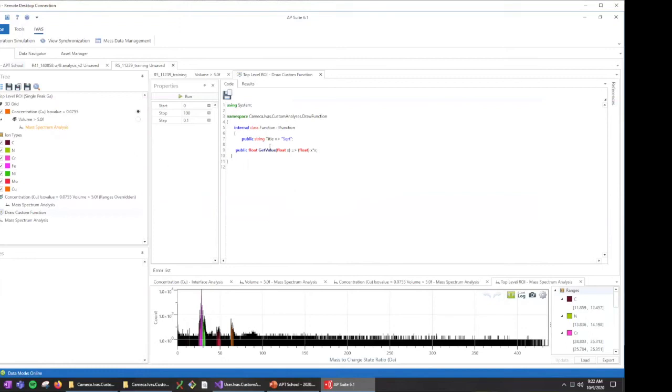One thing I wanted to note is that people may have seen this in APSuite 6.0: this coding interface you see on the screen right now was the main way we were doing scripting. We found out really quickly that most people don't want to write code in this bare editor. They want to use an IDE. When we realized that everyone was using an IDE anyway, we took the focus away from having a built-in code editor inside IVAS and said, use a real code editor outside of IVAS.